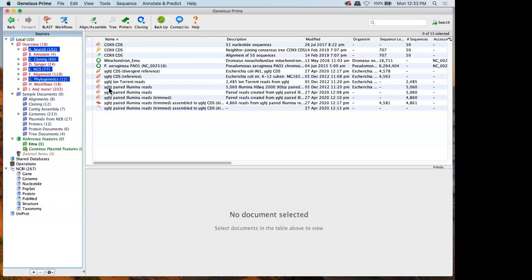We do have lots of command line programs that run very well on the Tufts cluster. My recommendation would be to try out what you can do in Geneious, and once you outgrow that, we try to figure out how you can run it on the command line, really making use of the full cluster compute power.